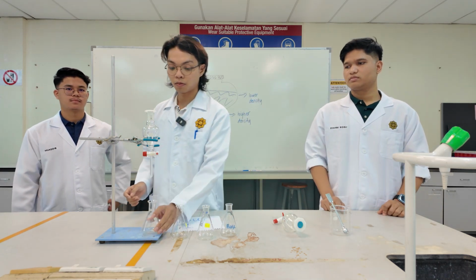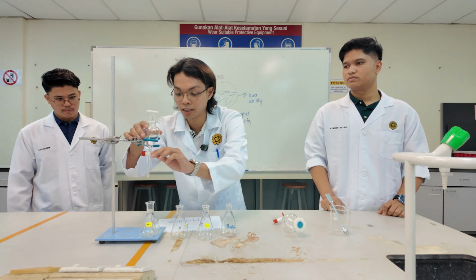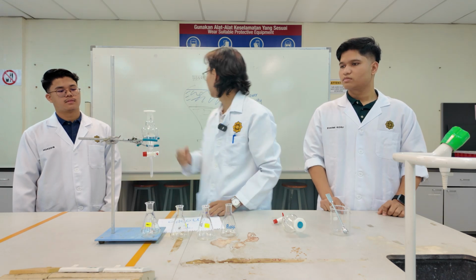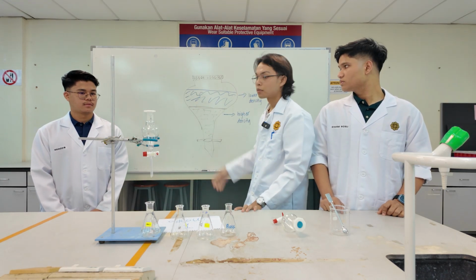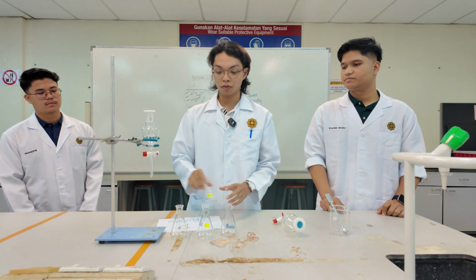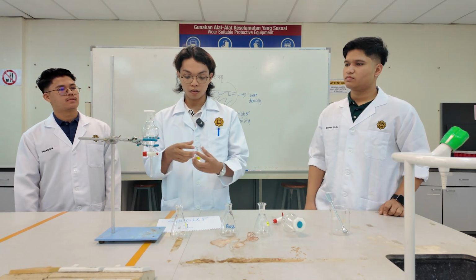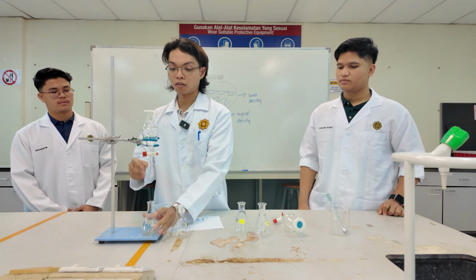After that, the first one is the mixture. You need to use the mixture flask, and then you need to extract it slowly until the end of the first layer. And then after that, because the remaining is still only base, you can transfer all of it to the base flask.